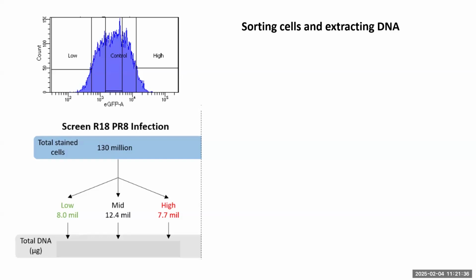Also, getting single cell suspensions is really important. Because if you have cells stuck to each other, you're going to have a situation where a cell that's stuck to one with a different phenotype is carrying a guide. And the cell sorting machine, you tell it to chuck out anything over a doublet. If you've got lots of cell clumps and doublets, they're all going to get chucked out and you're going to lose cells.